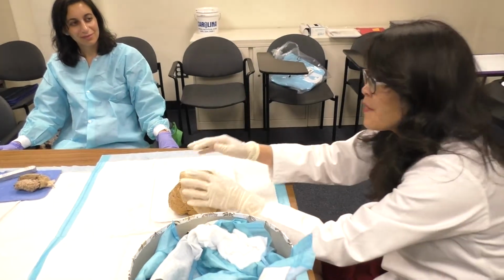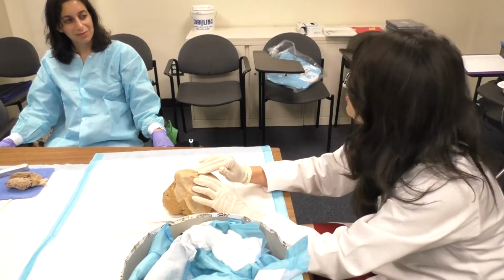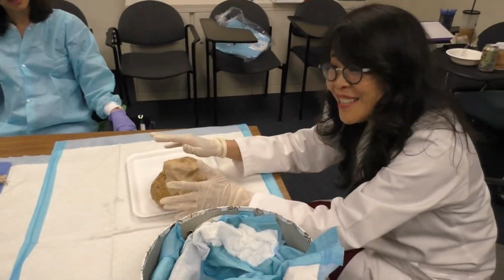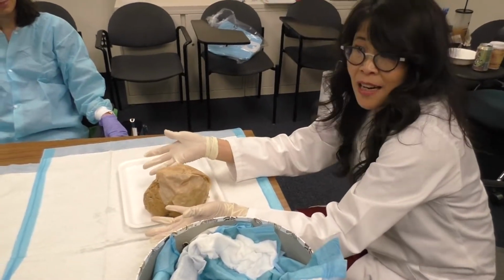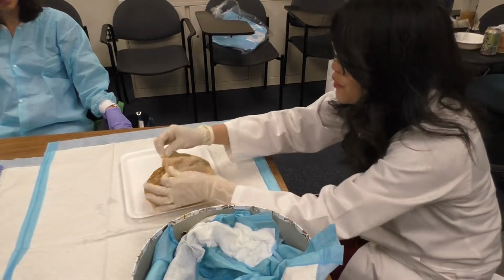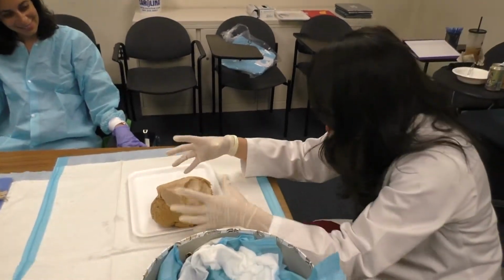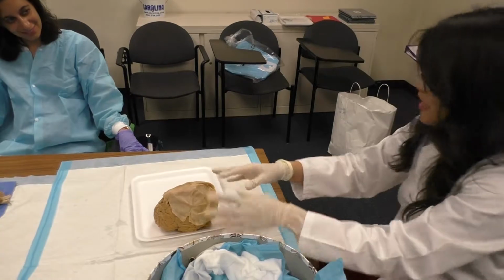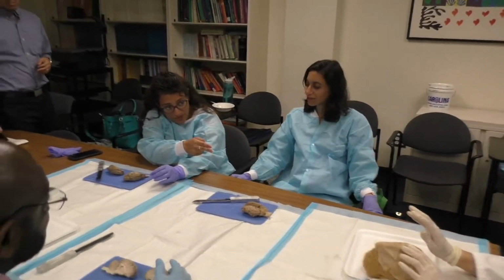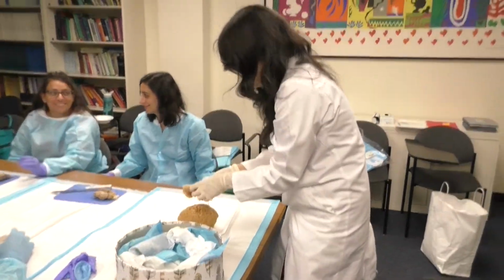And so I always make the joke that the packager of tofu must have been a neuroanatomist because he took the strategy that the brain uses. I mean, what's more precious to protect, right? The brain, and I don't want it banging up on the surface. So I, as God-like person that I am, have designed this waterbed protection mechanism. And it goes between the hemispheres as well. Yeah, exactly. So it lets us go on roller coasters.